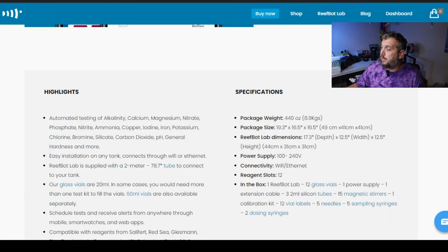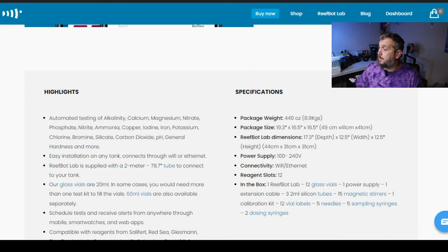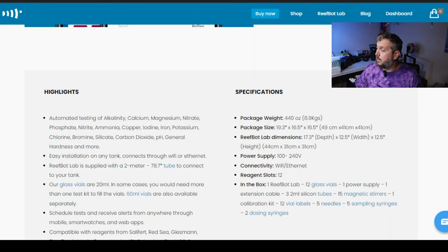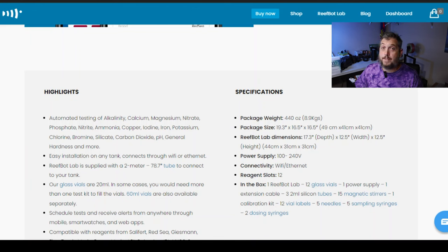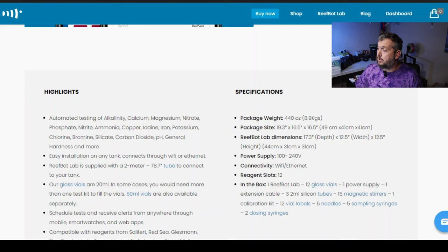But what is included with the ReefBot lab, so in the box you get one ReefBot lab, you get 12 glass vials, you get the power supply, an extension cable, you get 3 2 milliliter silicone tubes, you get 15 magnetic stirrers, 1 calibration kit, 12 vial labels, 5 needles, 5 sampling syringes, and 2 dosing syringes. No matter what side of the hobby you're on, salt water or fresh water, the ReefBot lab is just the tool that you need to test your aquariums automatically and get notified whenever your test results are in.